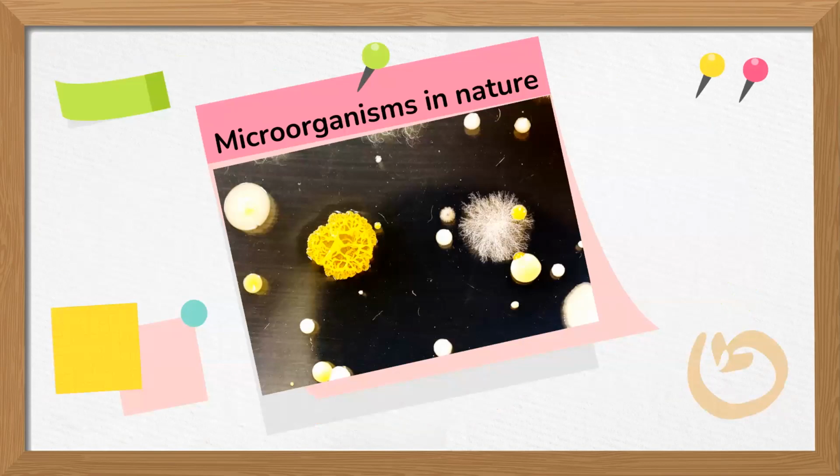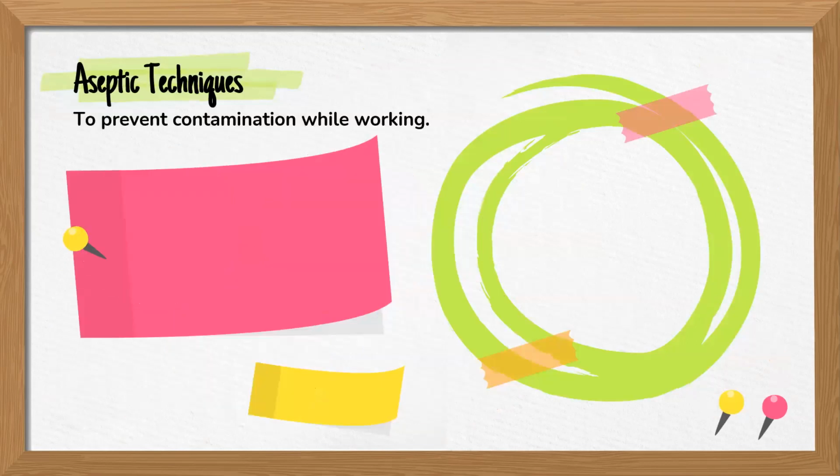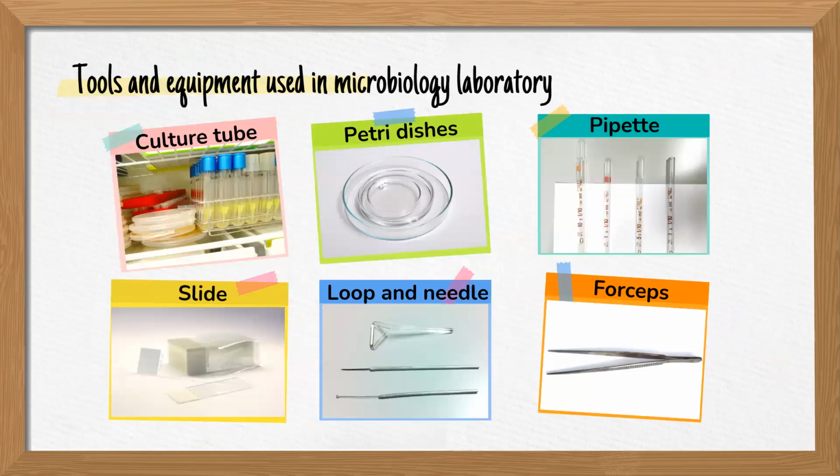So, the first experiment, I would like you to study the tool and the equipment used in the microbiology laboratory. Let's move on to the first slide. As I have introduced you to the tools and equipment used in the microbiology laboratories, here are some examples of materials and equipment that we normally use in the lab.